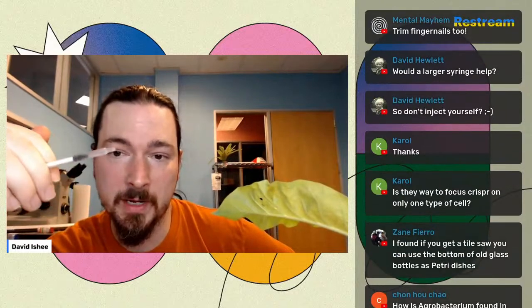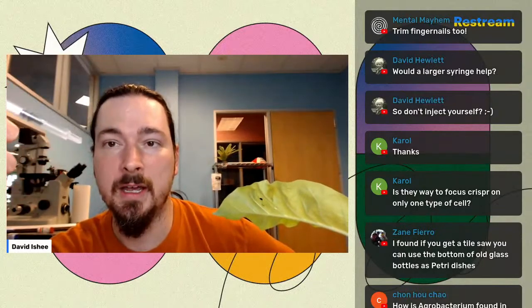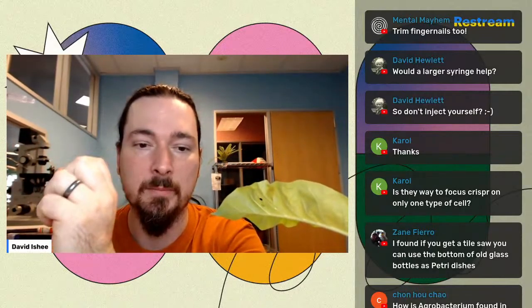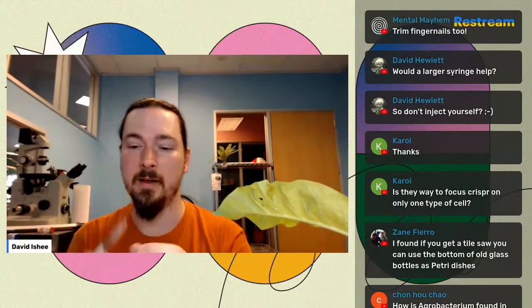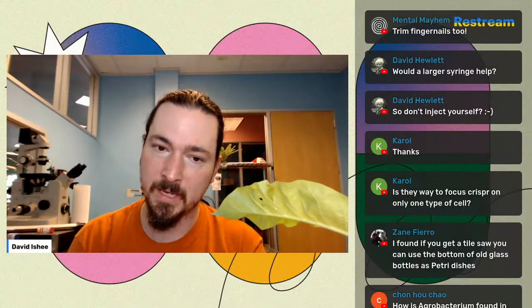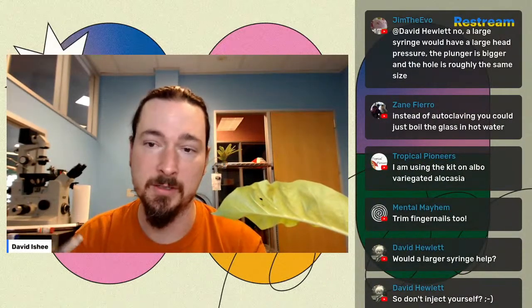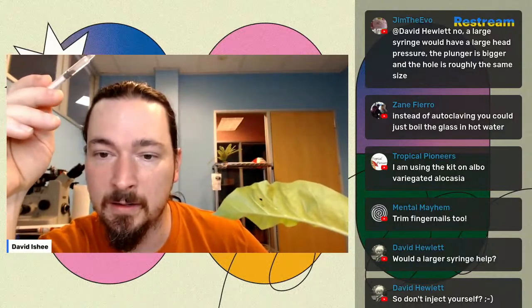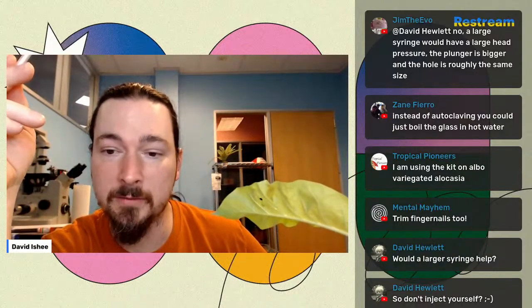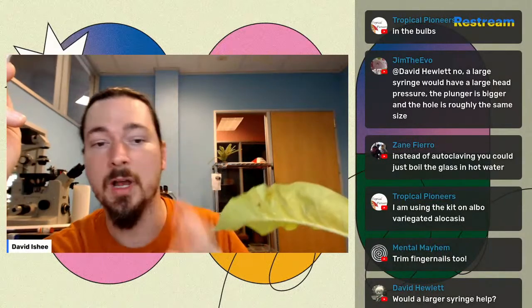For me, the smaller syringe is better. And I mean, if you're cutting with your fingernails, definitely. Because you're using the tips, and most syringes are Luer lock size, so as far as the actual surface area of the syringe end, it's pretty straightforward. And some brands of syringes have more rounded or more sharply cut edges. And instead of autoclaving with glass, you can definitely just boil stuff too, or even just put it in the oven and cook it at high temperature for a long time, you can sort of dry autoclave things.